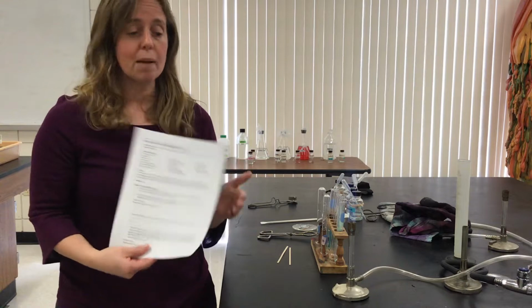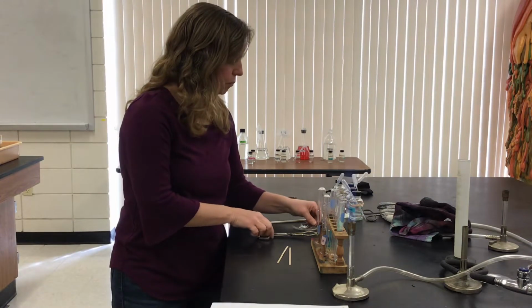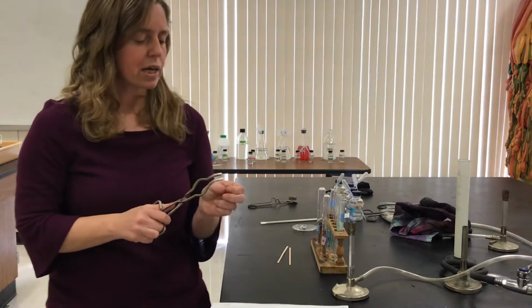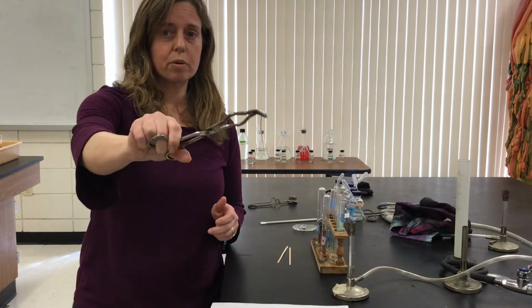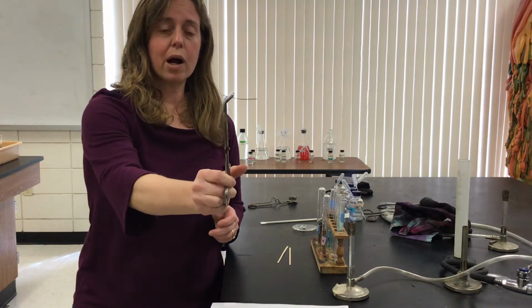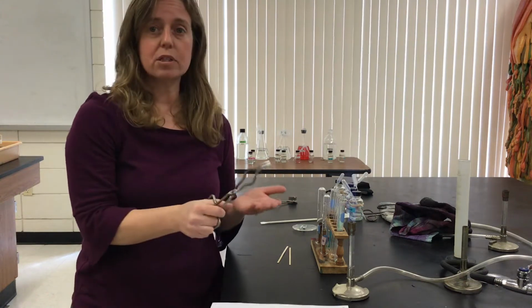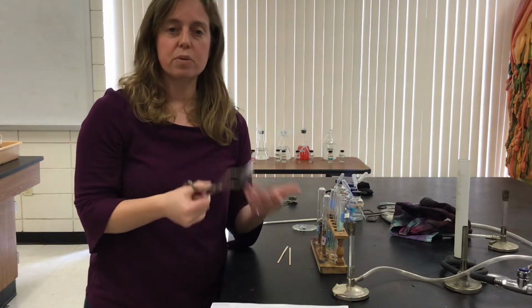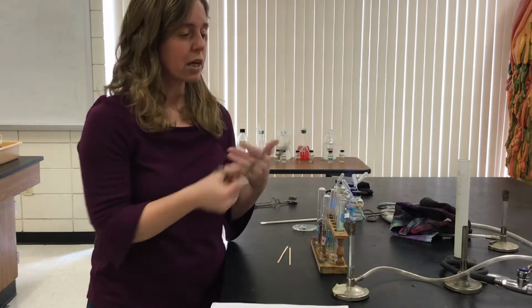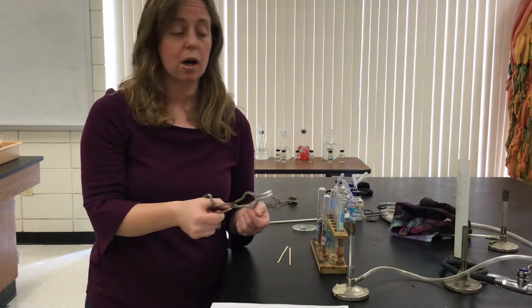All right, so the first lab that we're gonna do is gonna be a combination or synthesis reaction. Now remember, we've talked about this, when you are taking a synthesis reaction, so we have copper wire right here. So can you see the copper wire? The copper wire, we're gonna heat. It's nice and shiny, and we're going to heat it in the Bunsen burner. Now remember, when you're heating something, you're reacting it with oxygen. So that's where the synthesis part is coming in. So you're taking copper wire, heating it in a flame, reacting it with oxygen, and producing copper oxide.